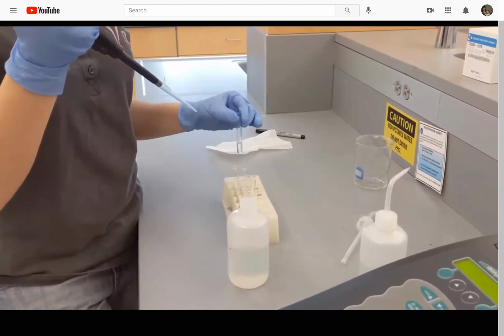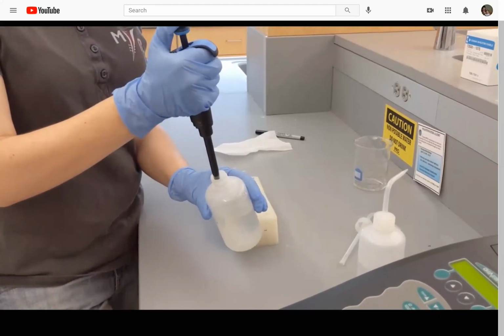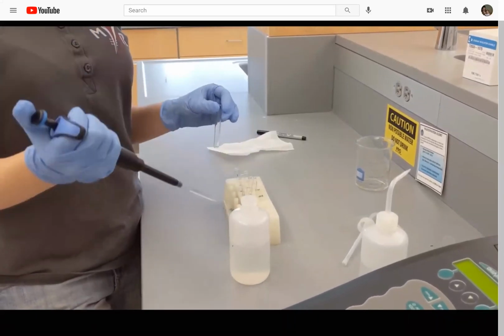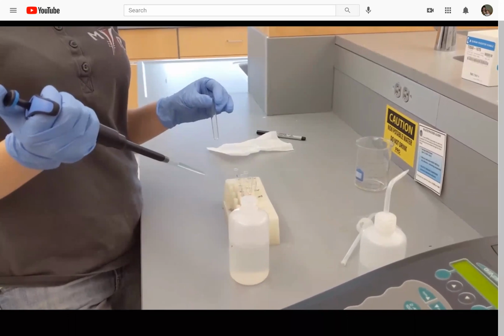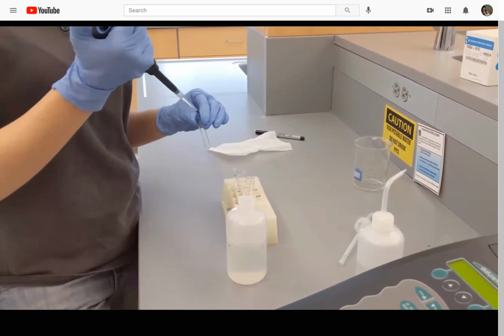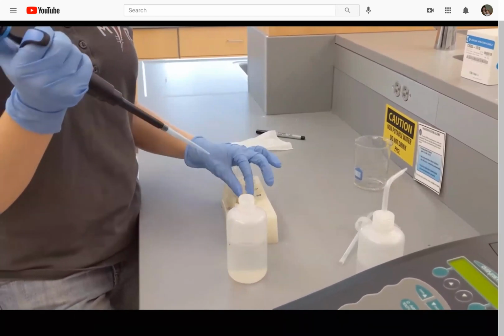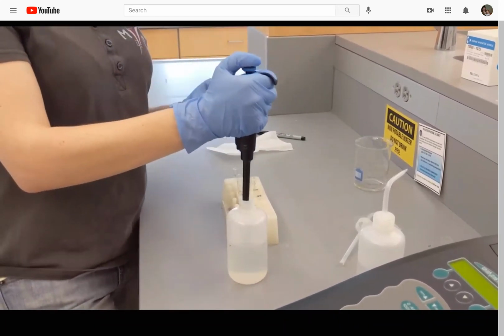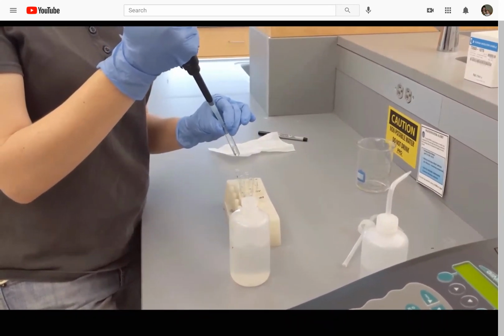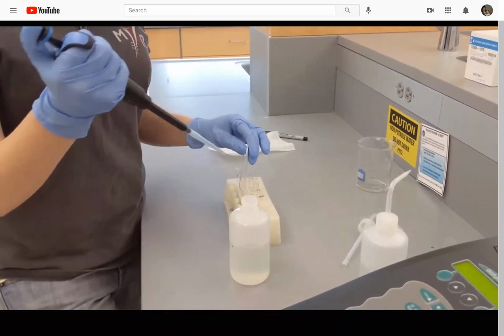All right, so the instrument I'm using here is a micropipette. It reads in microliters, which is why I went ahead and converted the milliliters to microliters. And in just a second, we will zoom in on where you can see that measurement. But when you're using a micropipette, you're going to push down to the first stop to draw liquid up into the pipette. And then when you're dispensing it, you are going to push down to the first stop and push to the second stop in order to dispense all of that liquid.